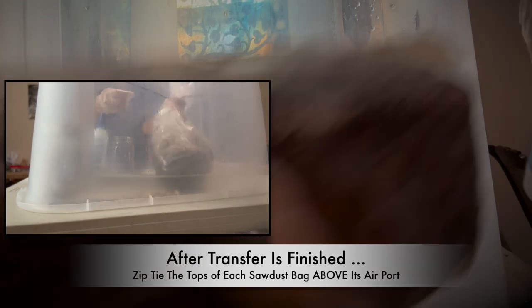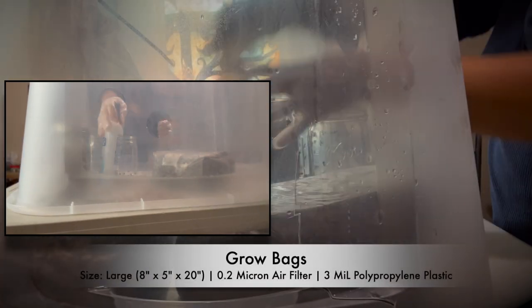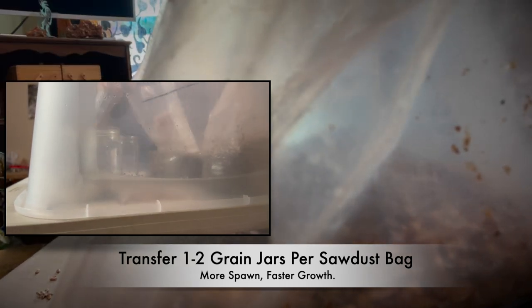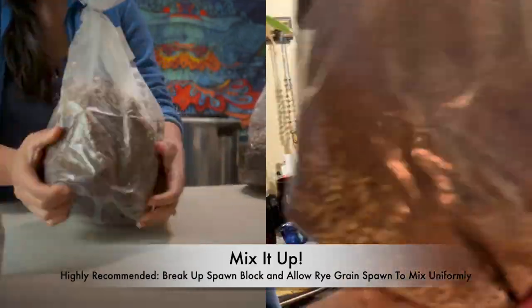In order to minimize contamination, make sure you do your best to not let the jar touch the tops of the grow bag, and remember to zip tie the very tops of the bags. Spills happen and that's okay. Our pressure cooker can accommodate four grow bags — some were inoculated with two jars worth of spawn and some with just one. The bag with more spawn will fully colonize much faster.